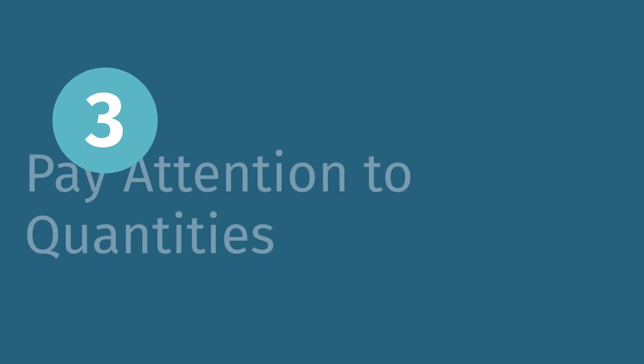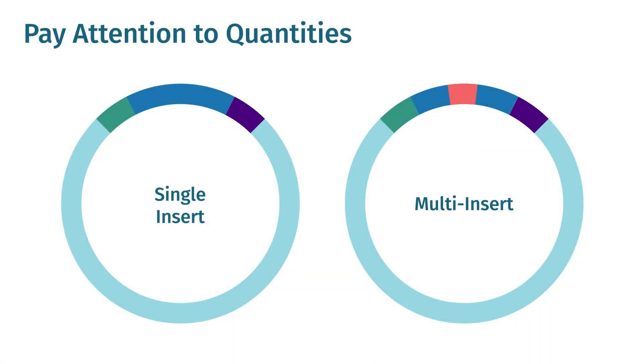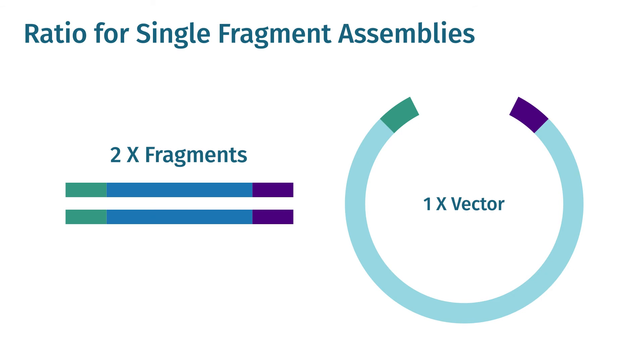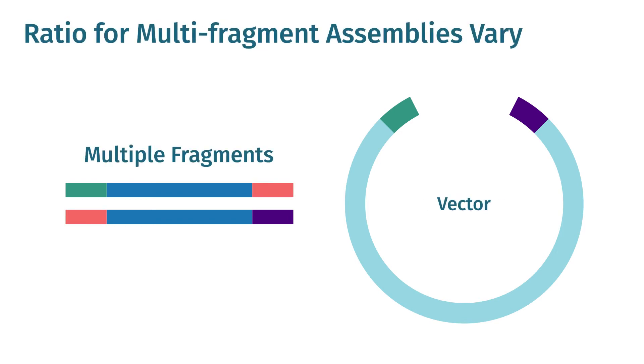Tip three: pay attention to quantities. Each manufacturer provides slightly different instructions regarding how much of each fragment to use. In general, the recommendation is for two copies of fragment per copy of vector. Multi-fragment assemblies have their own recommendations. Note that the guidelines are not just for molar ratios but also for the total mass of DNA added to the reaction.